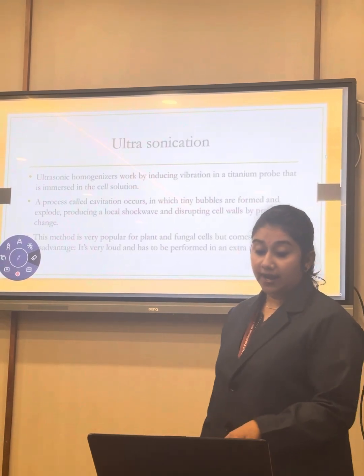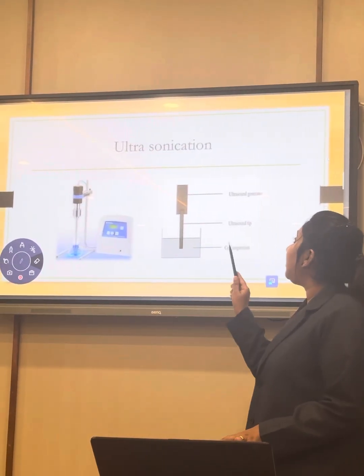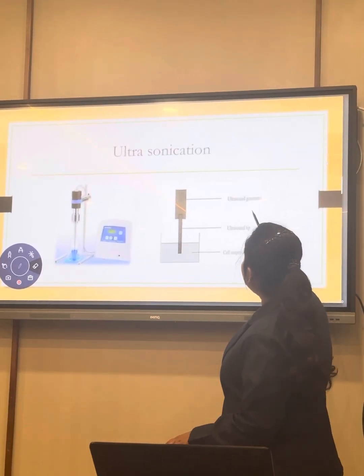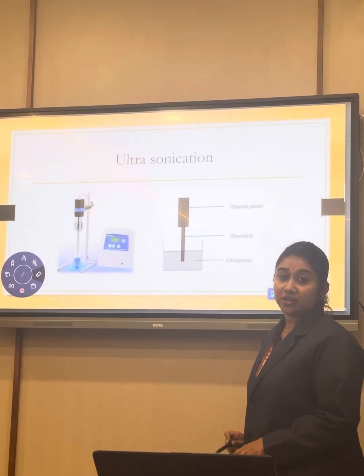Okay, next, this is the image of the ultrasonicator. This is the sonicator. This part is the ultrasonicator generator. It is a tip. This part is the cell suspension.